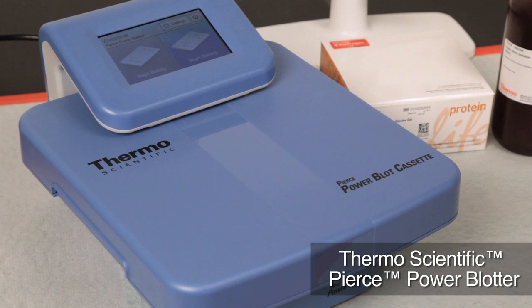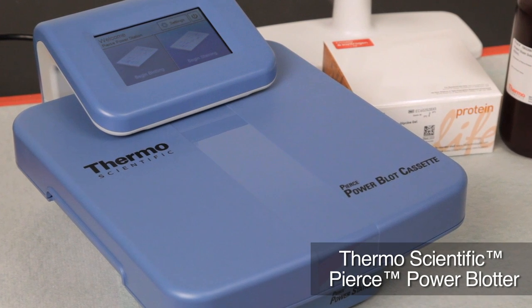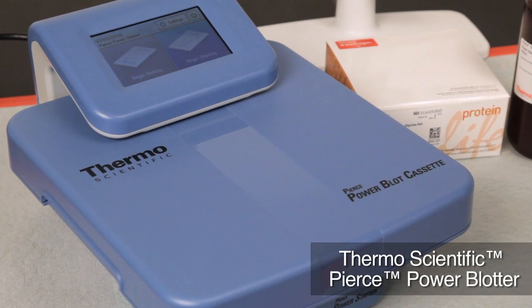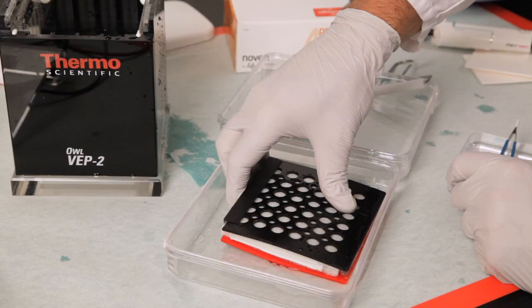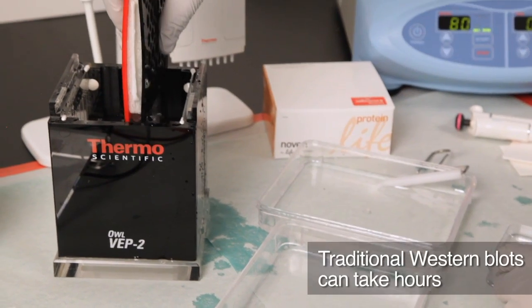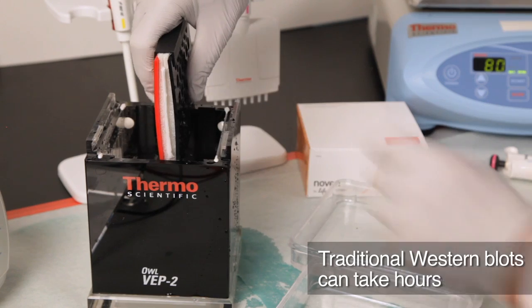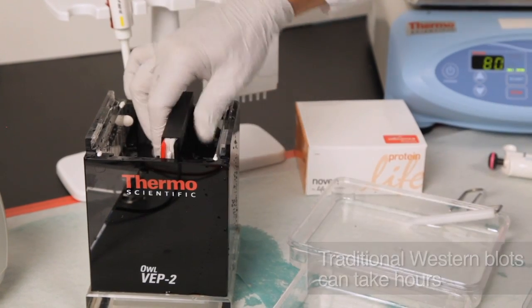The Thermoscientific Pierce Power Blotter is designed for rapid semi-dry transfer of proteins from polyacrylamide gels to membranes. Traditional western blot techniques often require a transfer of one hour to overnight to achieve good transfer efficiency.